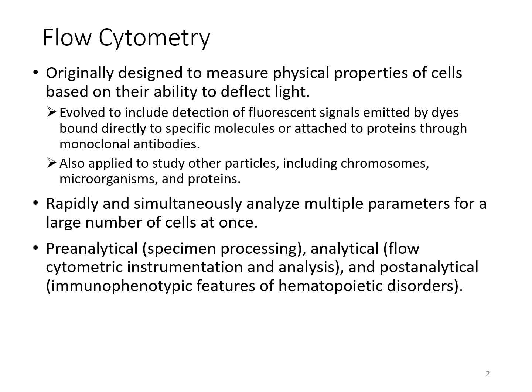So what we're going to do is talk briefly about some of the pre-analytical, analytical, and post-analytical phases of flow cytometry. However, we're not going to go into a lot of detail because you do touch on this in some of your other courses in more detail.